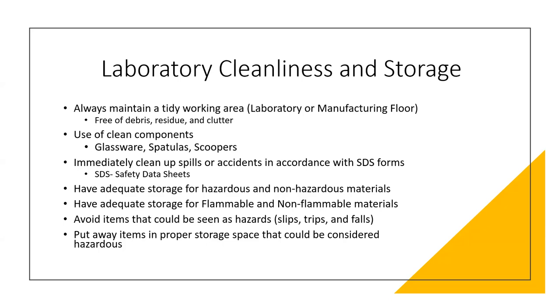Immediately clean up spills or accidents in accordance with SDS forms. We went over that in the video. There should always be available to you, we want to stay aware and up to date of our SDS documents. This is a detailed informational document prepared by the manufacturer or importer of hazardous chemicals. They should have a designated location easily accessible to you. So when you go through your initial laboratory tour, this should be something that is pointed out to you immediately.